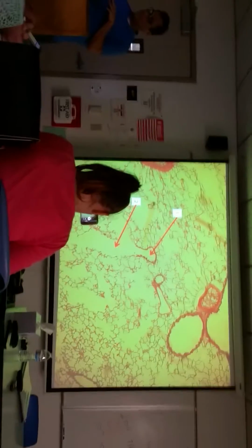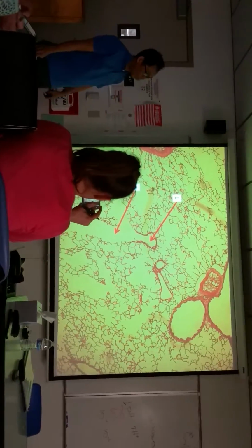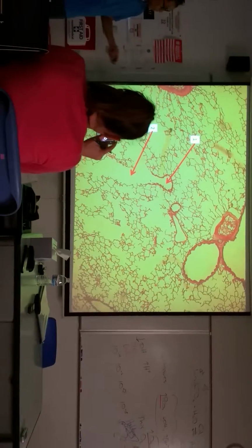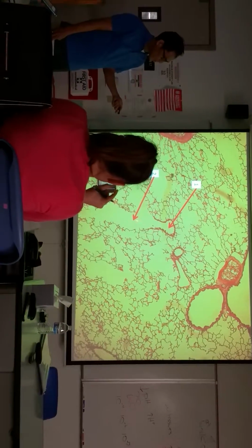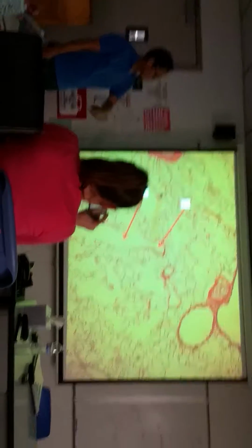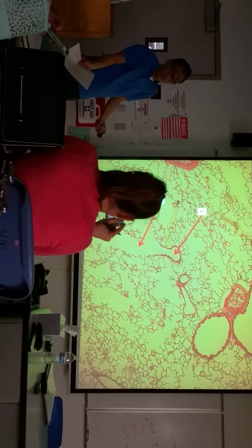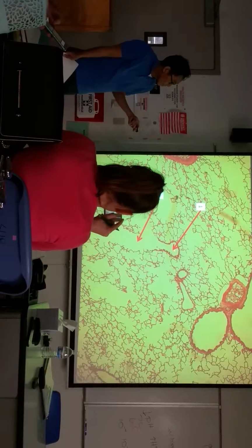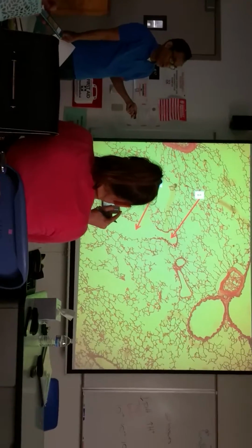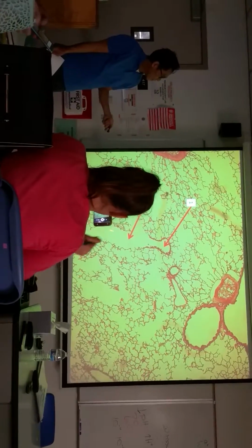Moving on to deep in the lung tissue. This is normal, healthy lung. 1 is pointing to the inside, the lumen, of the bronchiole. 2 is the hallway. What do I call the hallway? Alveolar duct. So if that's all that's labeled, that's all I would ask you. But there's a lot of cool stuff here. What was 1? Bronchiole. Thank you. What was 2 again? Duct.